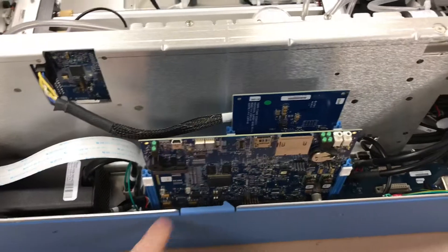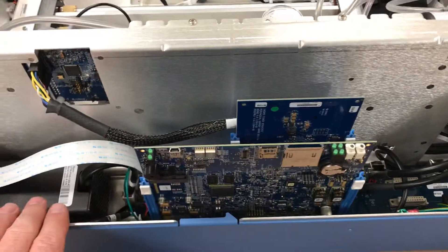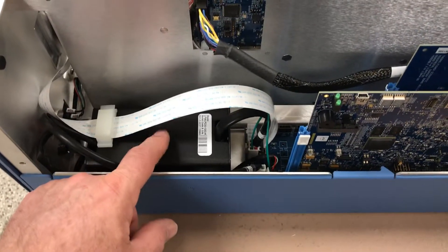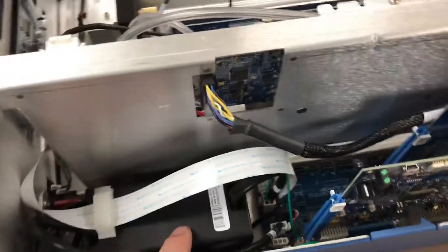They've done a big improvement to the motherboard and the CPU, which is all centralized here. The power supply is different from the i-series now — it's a more robust-looking DC power supply. So lots of changes on the electronics.